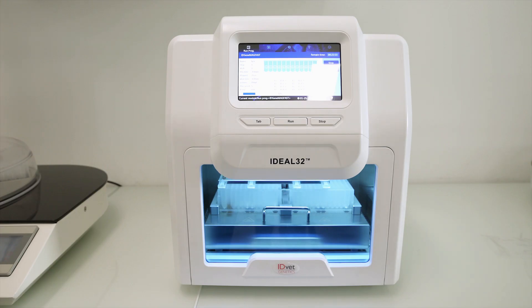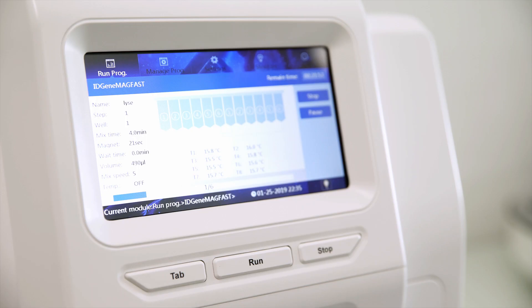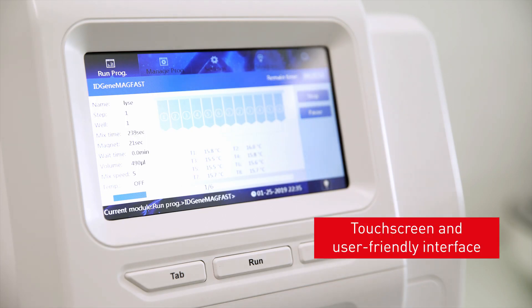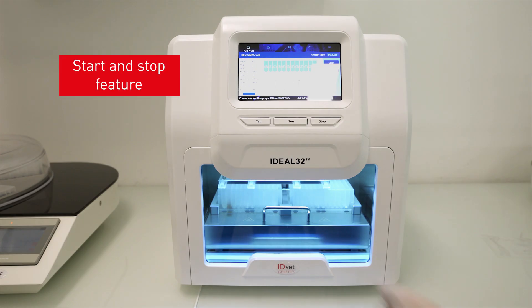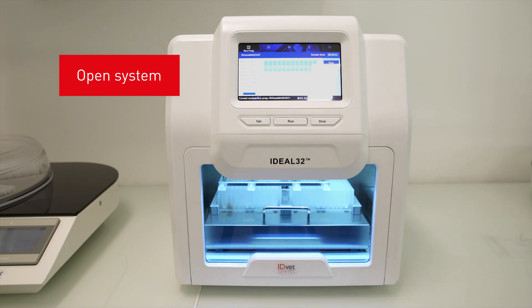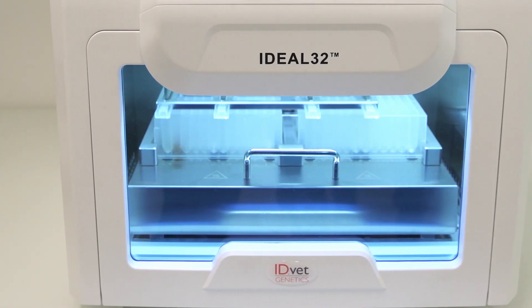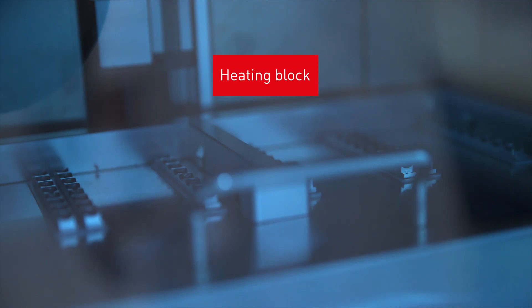The Ideal 32 robot also extracts nucleic acids from sample volumes ranging from 20 microlitres to 1 milliliter. The device is easy to use with a touch screen and user-friendly interface. This machine also includes a start and stop feature. The software is open with the possibility of simple programming, and the machine is CE certified. The Ideal 32 robot has two additional options: a heating block may be used for the lysis and elution steps, and UV lamps are included for decontamination.